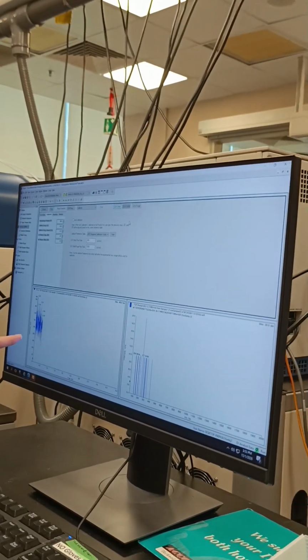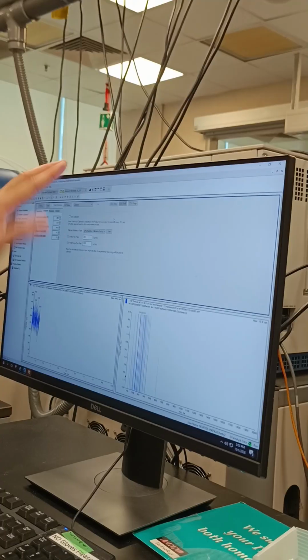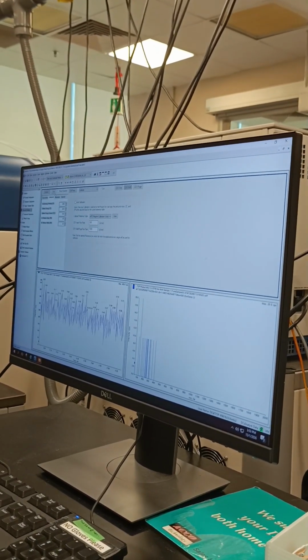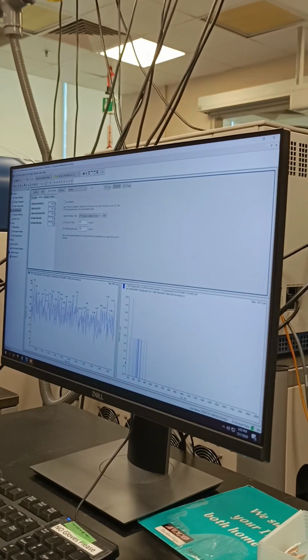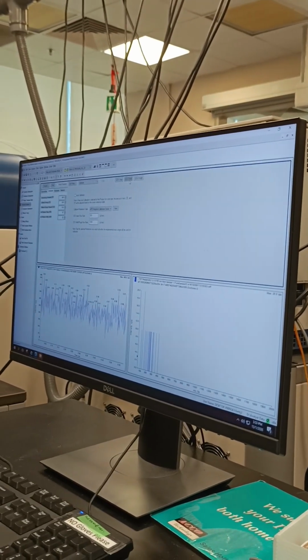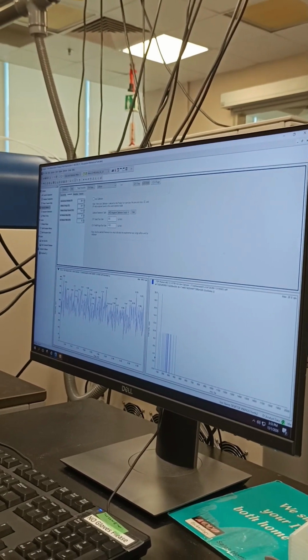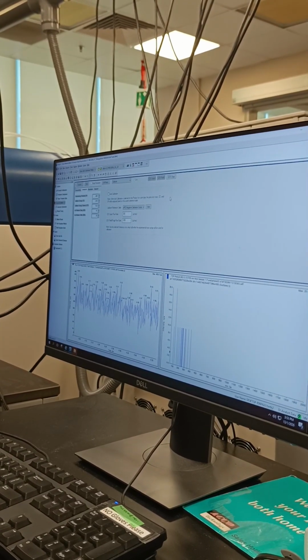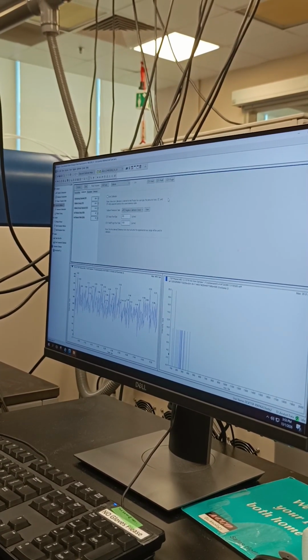So stop and inject everything. Even if you click stop, I think maybe it's a software bug. It just doesn't stop, so I just straight away stop from here. And then you see this button, you just never go back. So one way to fix it is you click CDS purge, and then stop it directly. Apparently it's a software bug.